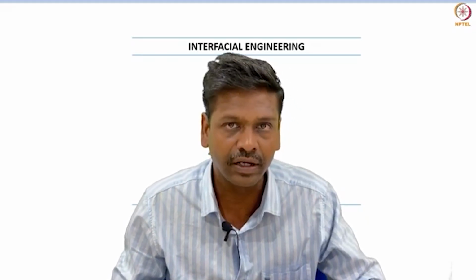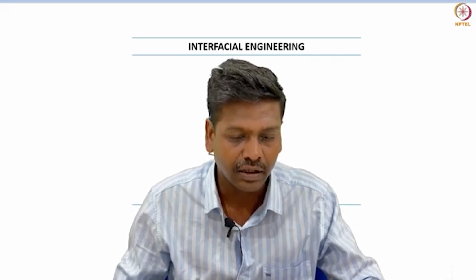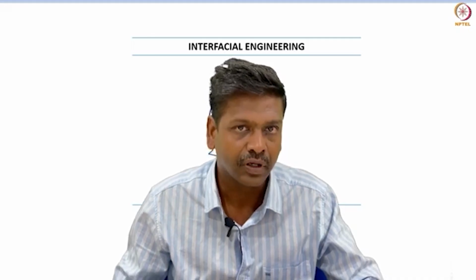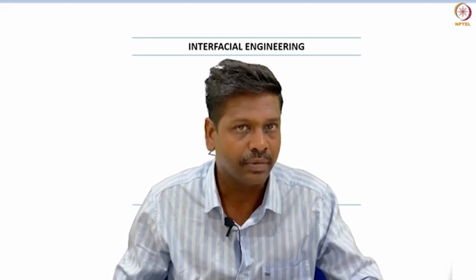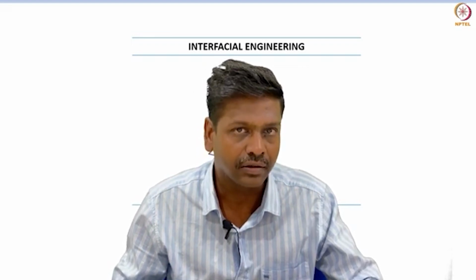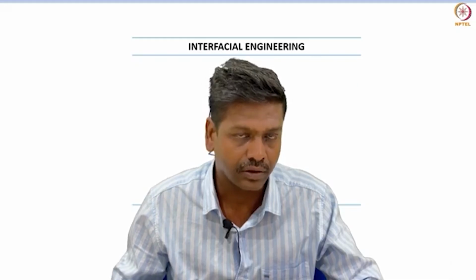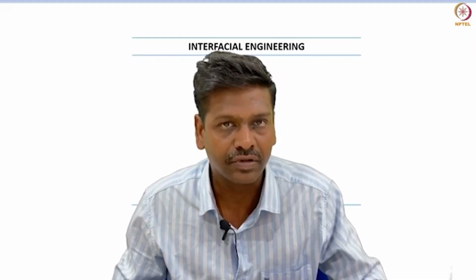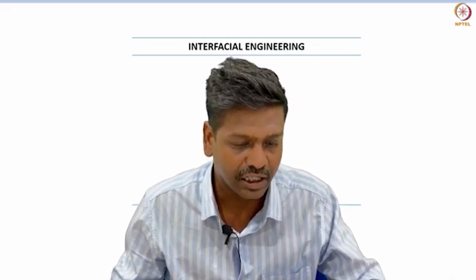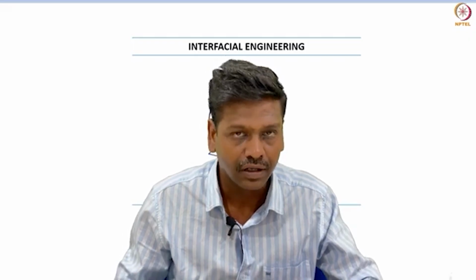This particular lecture will be divided into two. First, I will be giving you the overview of the device, right? After that, one of my PhD students will be taking you on a tour of the research laboratory, wherein he can show you the demonstration of the force tensiometer, right? So first, let me try to give you the overview of the force tensiometer. Let's begin.